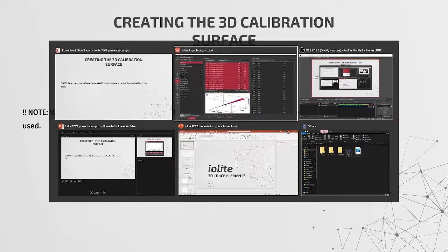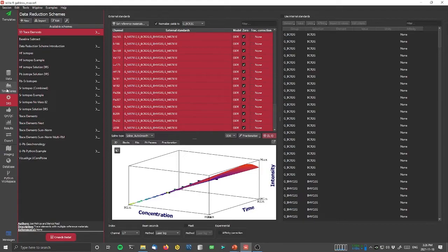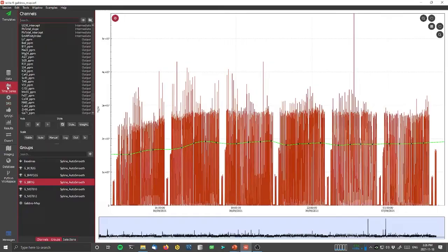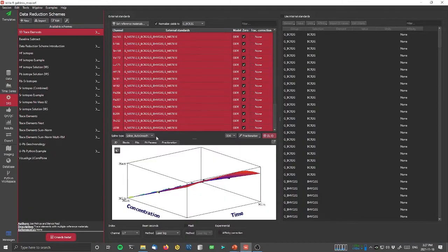That was one thing that I forgot to mention, was that this spline type here is what will determine our calibration interpolation through time. It doesn't take into account any of these other spline types. So you can see this one here is doing lots of craziness, but that spline is not really used at all in this calibration. So we could ignore these for the time being in the time series window. And this is the one that you need to worry about.